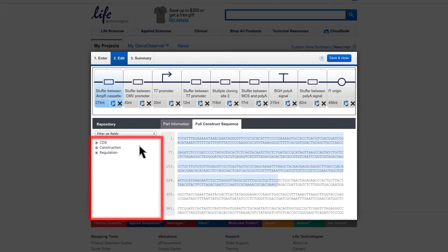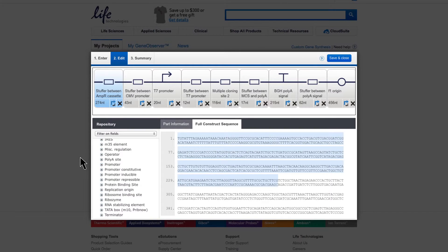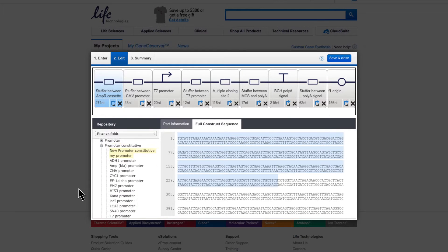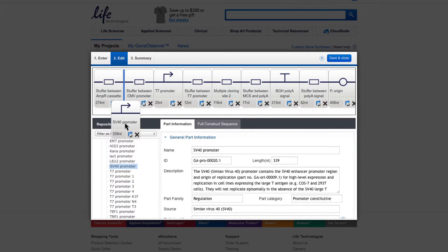Parts within the repository are organized into three families: Coding Sequences (CDS), Construction, and Regulation. Clicking on the plus symbol opens up the respective part family. Clicking on the plus symbol beside each category opens the category and shows all available parts within each category. Clicking on a part makes relevant part information appear within the Information pane. You can introduce a repository part into the construct by dragging and dropping the part from the repository.